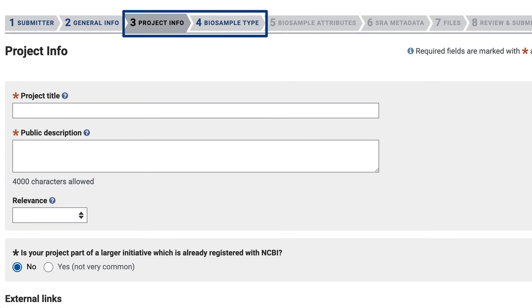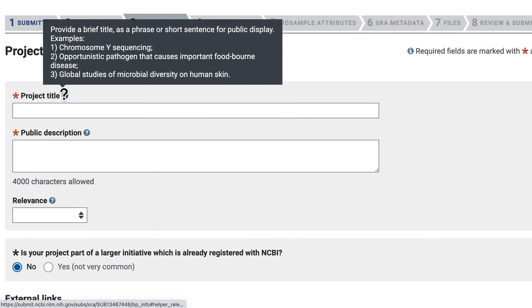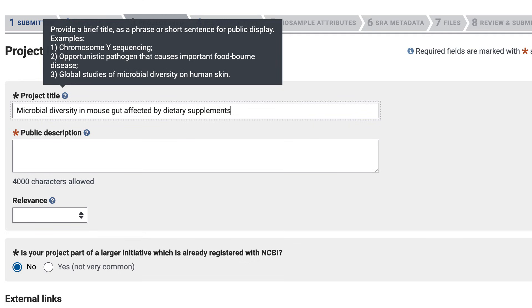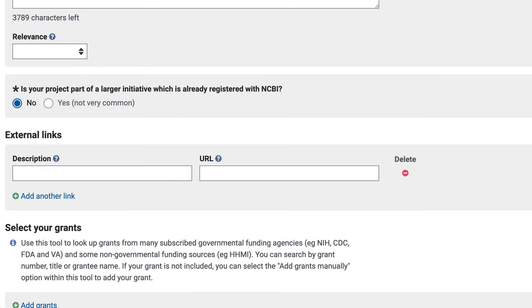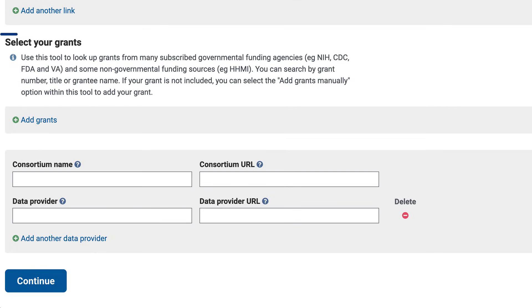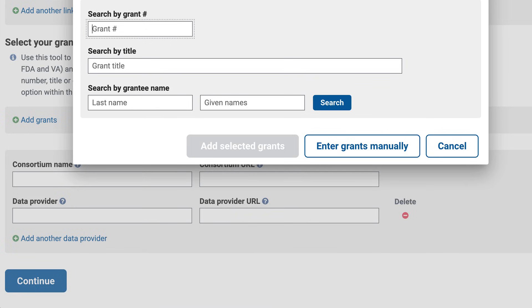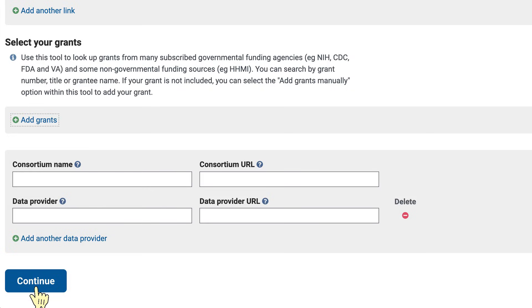We now see additional tabs for bioproject and biosample. These help tips are very useful, noting for a project title that this will be displayed publicly. I've pasted in my title and I'll add this description. My project is not part of a larger initiative, so I'll leave this as No. We highly recommend that you include the grant or grants associated with your project. With the Add Grants menu, you can look up your NIH grant right here, or add manually. For non-NIH grants, you'll need to provide the grant ID and title, as well as the funding agency.